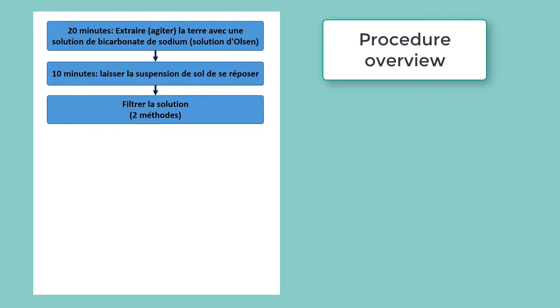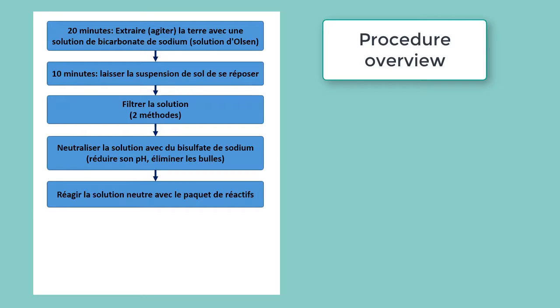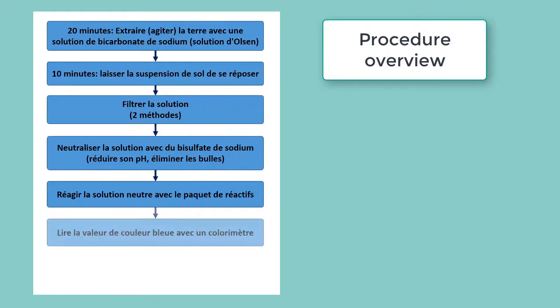There are two methods for that, and that gets rid of the rest of the clays in the solution, making it a clear solution. Then we neutralize this filtered solution with sodium bisulfate, which reduces its pH and will cause all the bubbles from the bicarbonate to leave. And then we will react that neutralized solution with a reagent package, which will create a blue color in the solution, which we then read using a colorimeter.